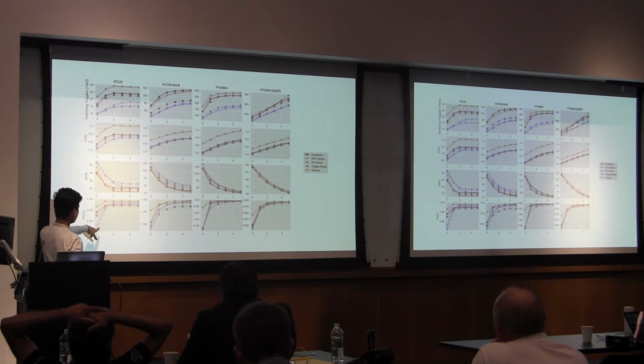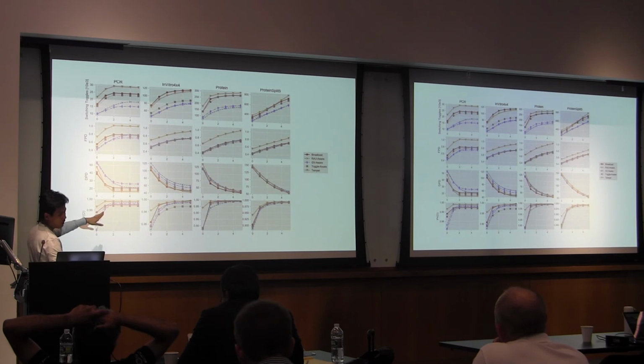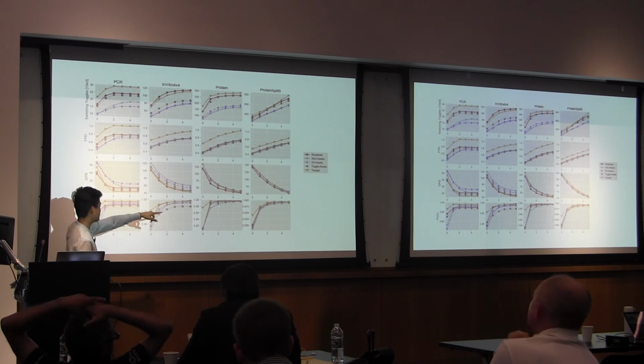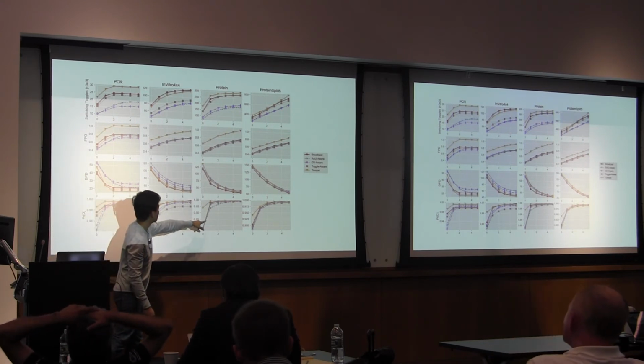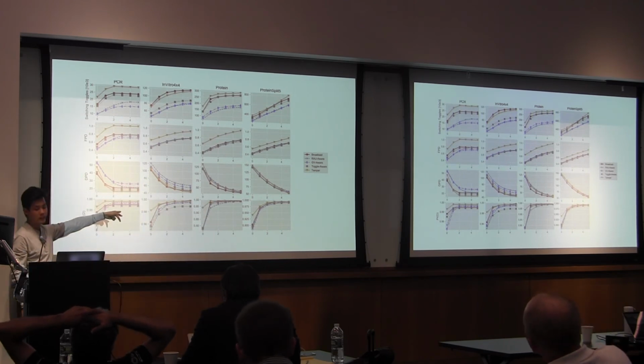Also interesting to note is that as you add indicator droplets, the performance gap closes, although in many cases the tamper-resistant pin mapper still outperforms the others. And then you can get very high probability of detection, approaching the ideal case, especially in the protein assay here. Even after just 1 indicator droplet, you can get pretty much all attacks detected.